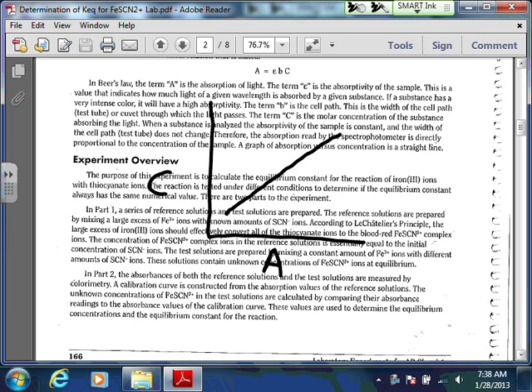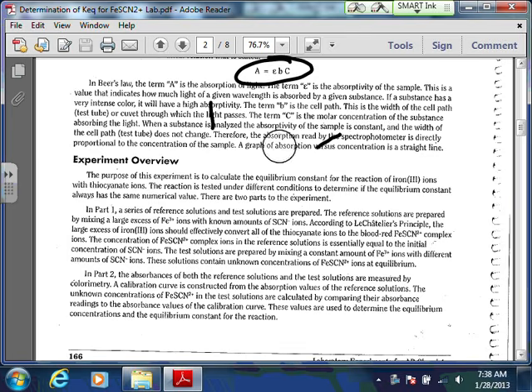And so instead of using Beer's law, because we don't know the E and the B, once we have our standard line here, our best fit line, then let's say that we measure an absorbance of one of our unknowns to be right here. We can just trace it over here and figure out what our concentration is, okay? And so that's kind of the strategy here, to figure this out experimentally without knowing the E and the B.